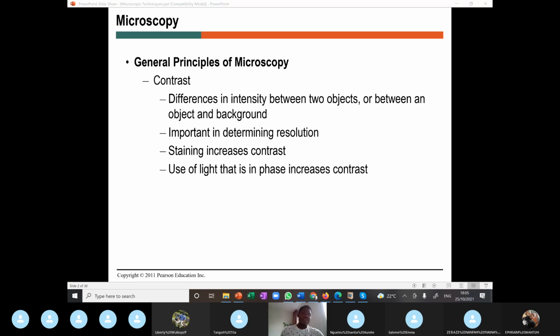Depending on the magnification of the lens, when the object is magnified, we are able to see it in a bigger form thanks to the lens. So when we use more than one lens at a time, we only increase the magnification and our ability to see the object.